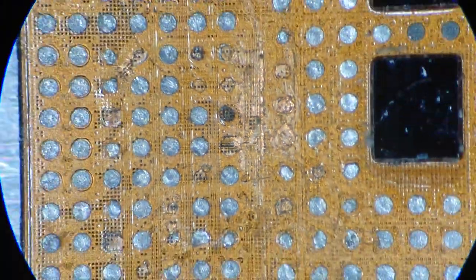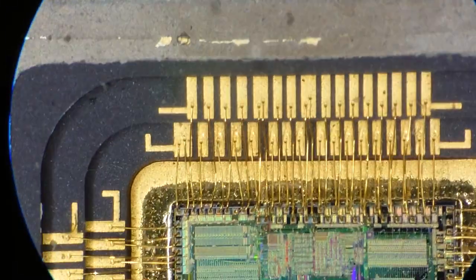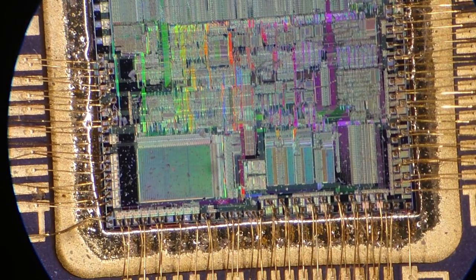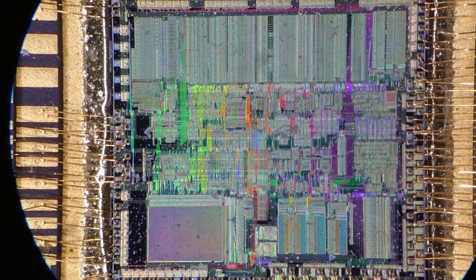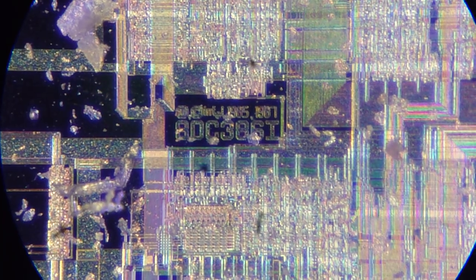Let's check the last thing we have. Let's check my i386 Intel processor. We can just see some structure here. It's my usual suspect. The structure is made by a bus of conductors. Using it we can see real quality of the channel, amount of chromatic aberration, and real resolution.